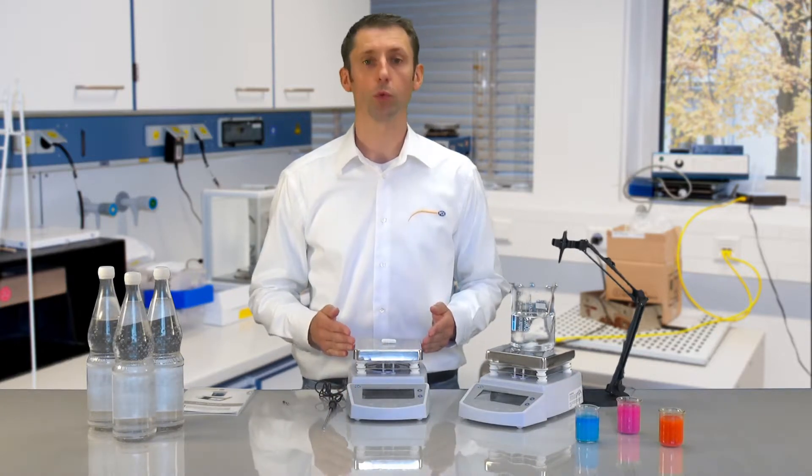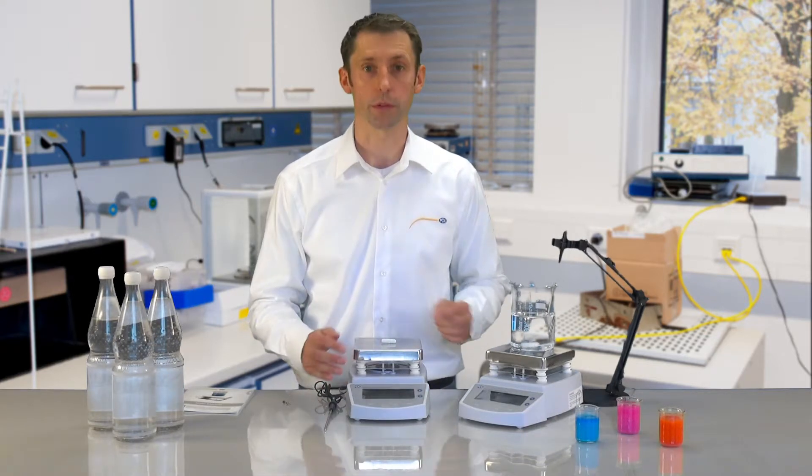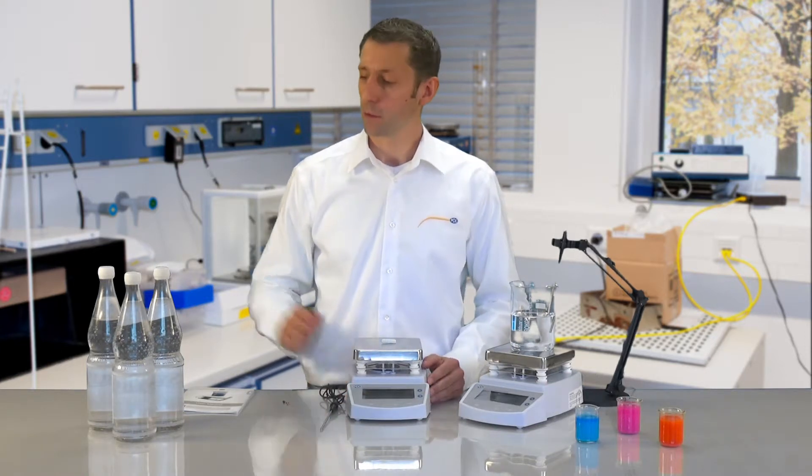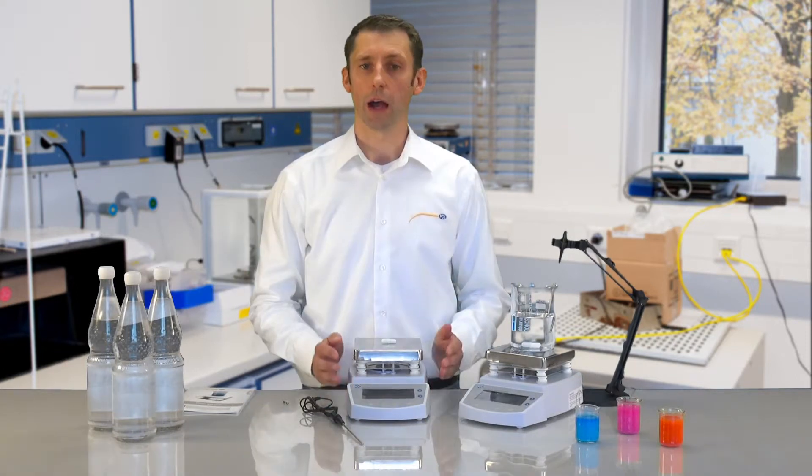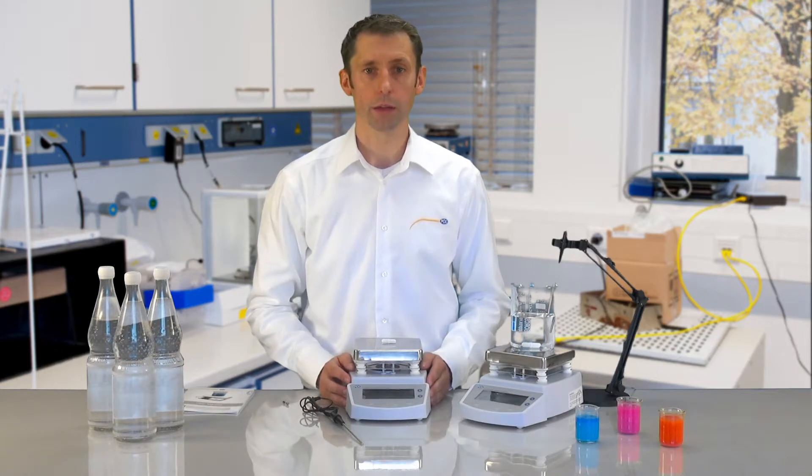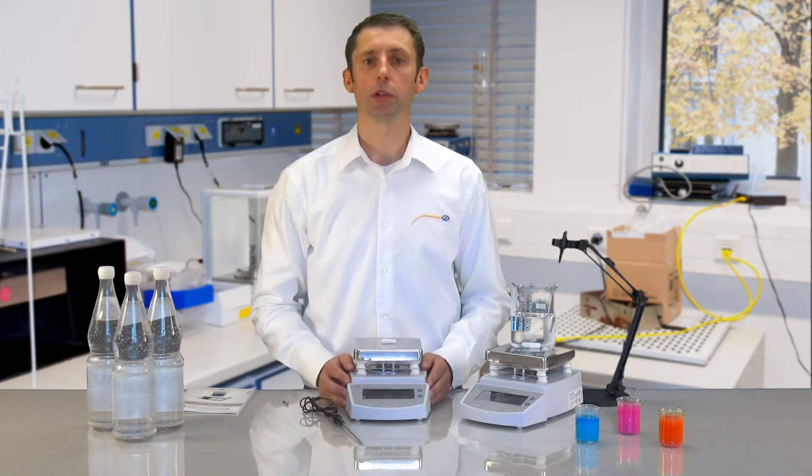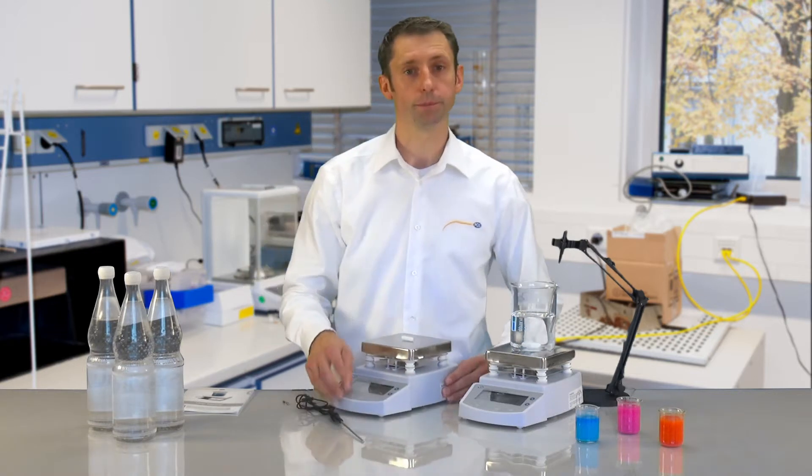The stirring field has a surface of 125mm by 125mm. The stirring volume is 2 liters, that is around the amount of water in these bottles. The settings for the stirring speed or the temperature and the stirring time are not saved after switching off. The magnetic stirrer consists of a plastic casing with a stirring surface of stainless steel.